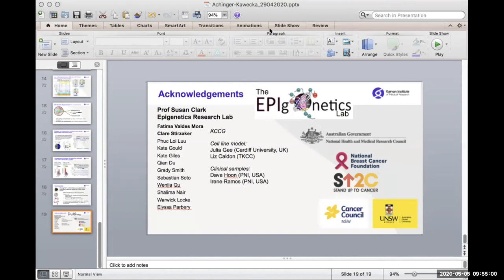So I haven't looked at it myself. I have cohesin data for the cell lines, but we don't get many peaks, and it's not very good quality, and cohesin is quite difficult to ChIP. I know that ER and promoter enhancer looping is associated with different chromatin remodelers, which has been shown previously by Jason Carroll's lab. But I haven't looked exactly at cohesin and the association. I think that's mostly because it's not such a good ChIP as CTCF, for example.